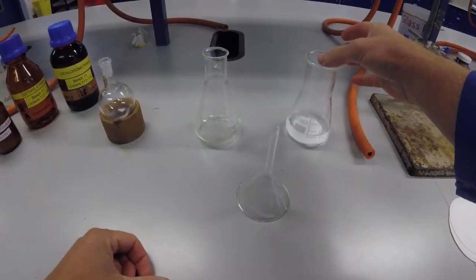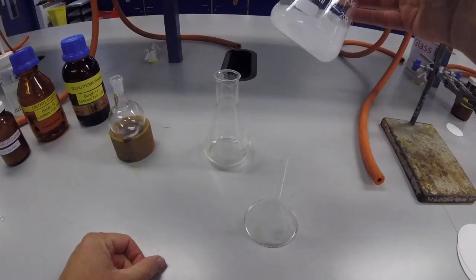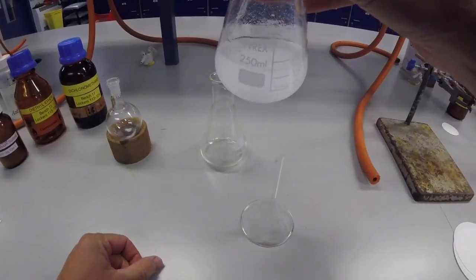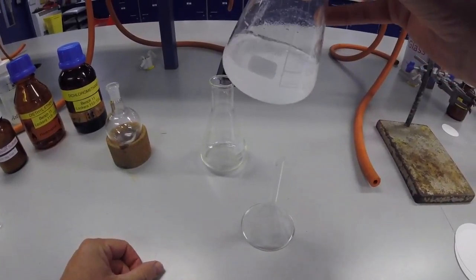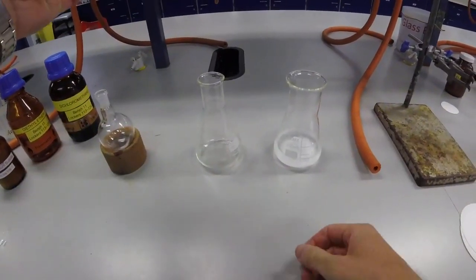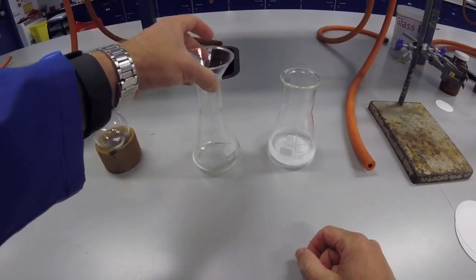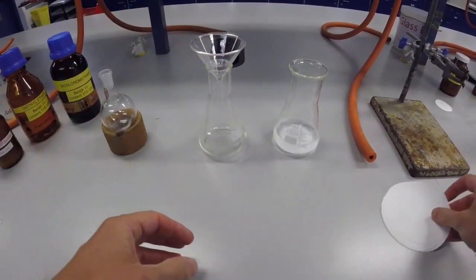Okay, so now I'm going to talk to you about filtering things. And we've got our solution with our suspension of magnesium sulfate that we want to filter. Works for filtering anything else. Simplest method is gravity filtration. So you just need a conical flask and filter funnel.